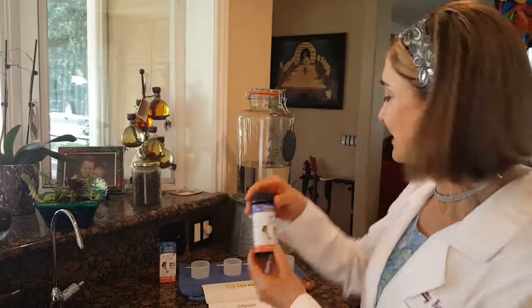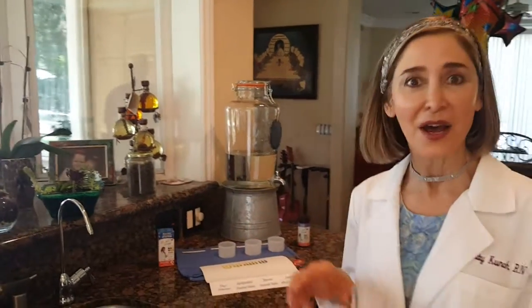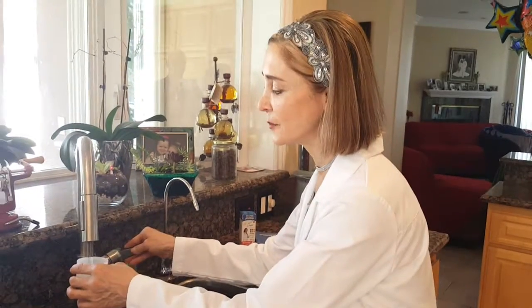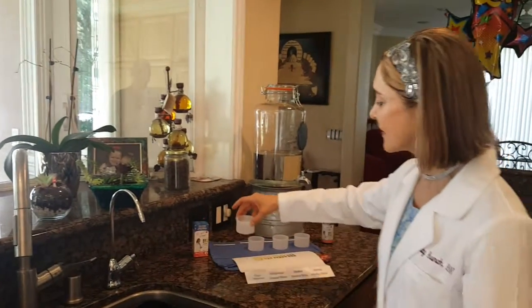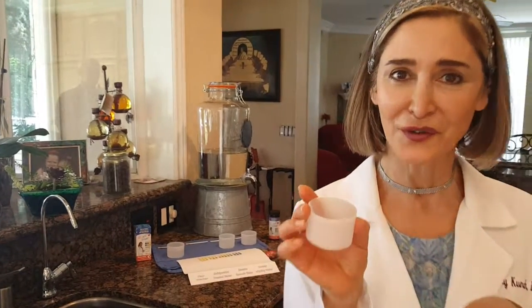Good morning! Today we are testing the pH of the water you consume, so let's go for it. First, we're going to take a specimen of the tap water out of the faucet. I'm just going to get the specimens first and then we'll test them. The next one will be from the refrigerator.